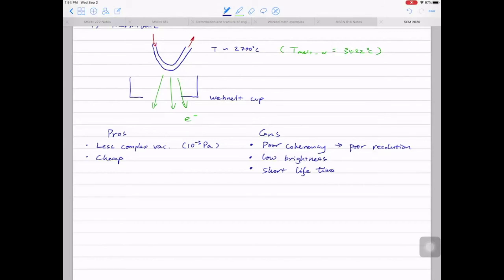Then if we fix a specimen and think about the electron beam interacting with it, the heat comes from the energy of the electrons. The higher the energy of the electrons, the more heat is dumped into the material. So how do you reduce the energy? You can do that in two ways: either reduce the voltage or reduce the current. Does this answer your question?